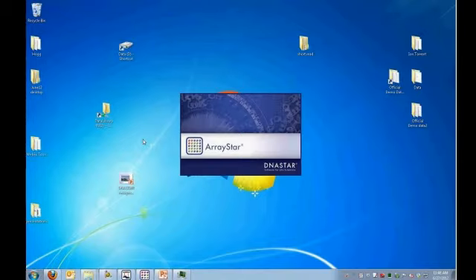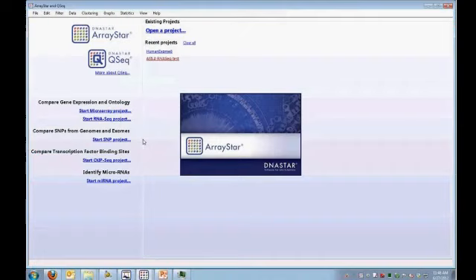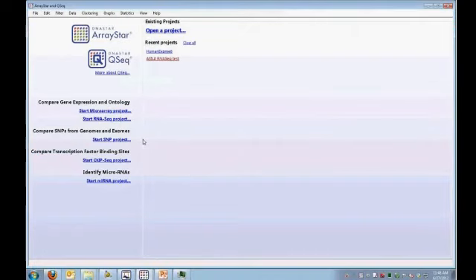While you're doing that, Matt, a couple more questions have come up. We're actually getting a lot of questions coming in, and I don't know that we'll have time for all of them, but we'll get to a couple. What kind of assembly would you recommend, de novo or templated, to identify large insertions and deletions in E. coli?